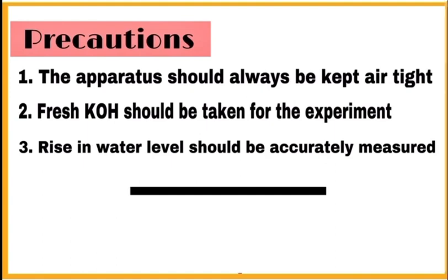Now write precautions. First, the apparatus should always be kept airtight. Second, fresh potassium hydroxide should be taken for the experiment. Third, rise in water level should be accurately measured.